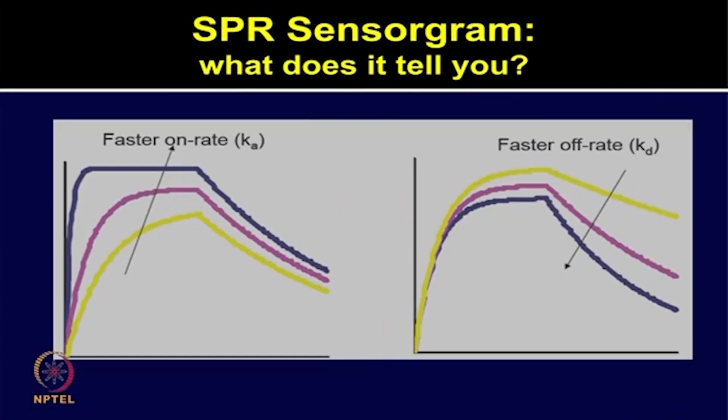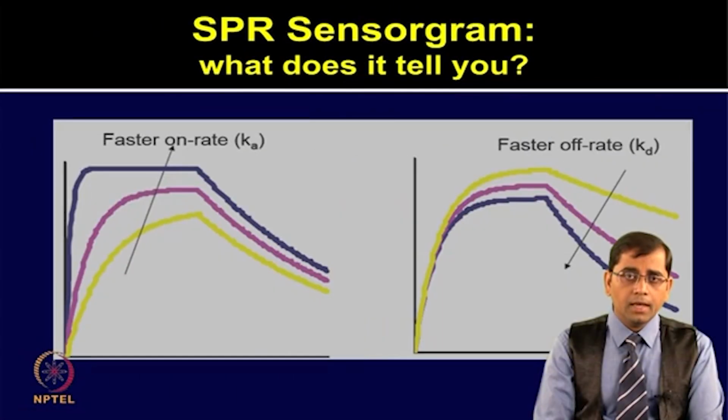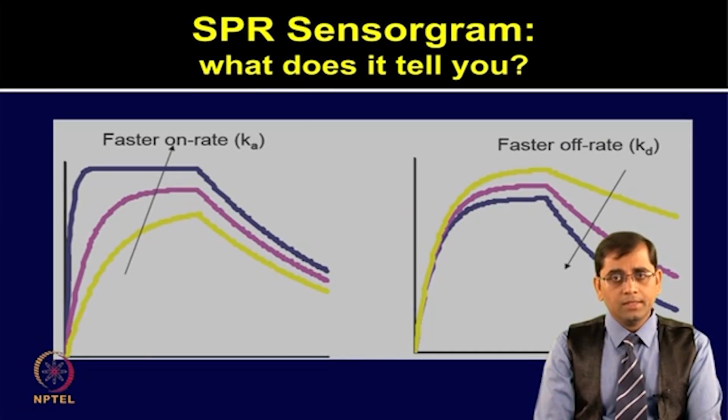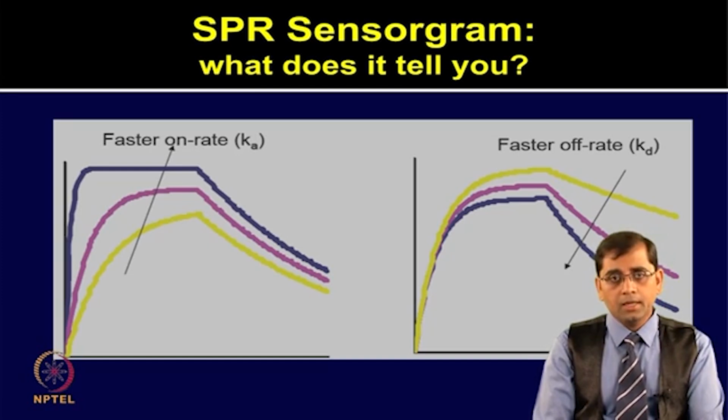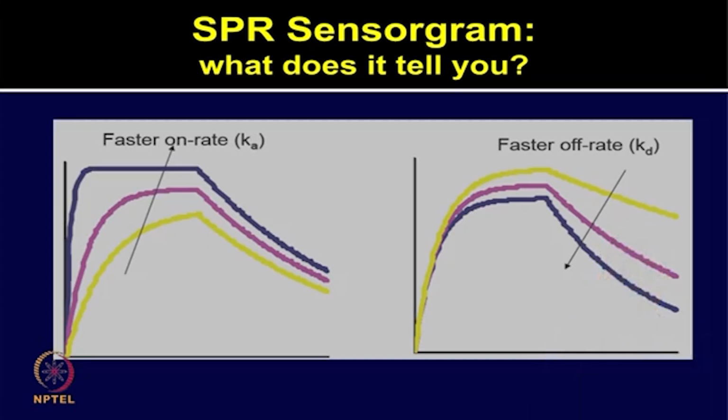As shown here in this slide, the on rate and off rate can provide us information as to whether it is slow or fast. In addition, comparison of various analytes can be made simultaneously for their association and dissociation rates by looking at these SPR sensorgrams. So, overall, the SPR assay means tracking the SPR angle to measure the binding events.